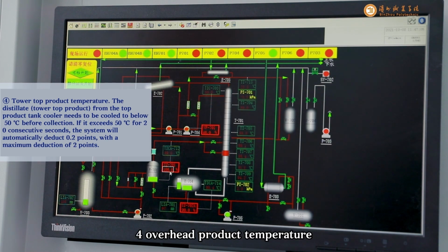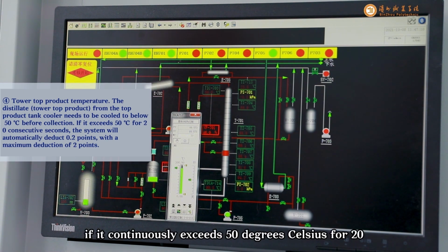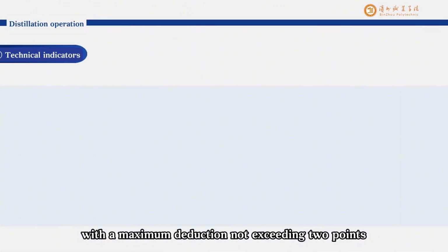4. Overhead product temperature. The effluent from the overhead product cooler needs to be cooled below 50 degrees Celsius before collection. If it continuously exceeds 50 degrees Celsius for 20 seconds, the system will automatically deduct 0.2 points, with a maximum deduction not exceeding 2 points.